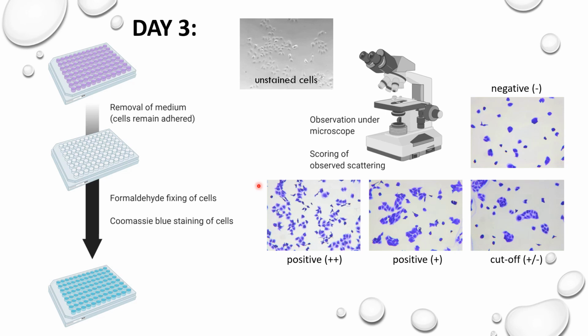However, when you are doing your experiment, you will include in your plate the right controls, the positive controls, the negative controls, and you will do a comparison within the plate, within your own experiment, and you as an observer will therefore be able to make some proper statements about the activity, for instance, of an agonistic molecule, or the inhibiting activity of an inhibitor that you developed that blocks the activity of, for instance, a challenging HGF/SF concentration.